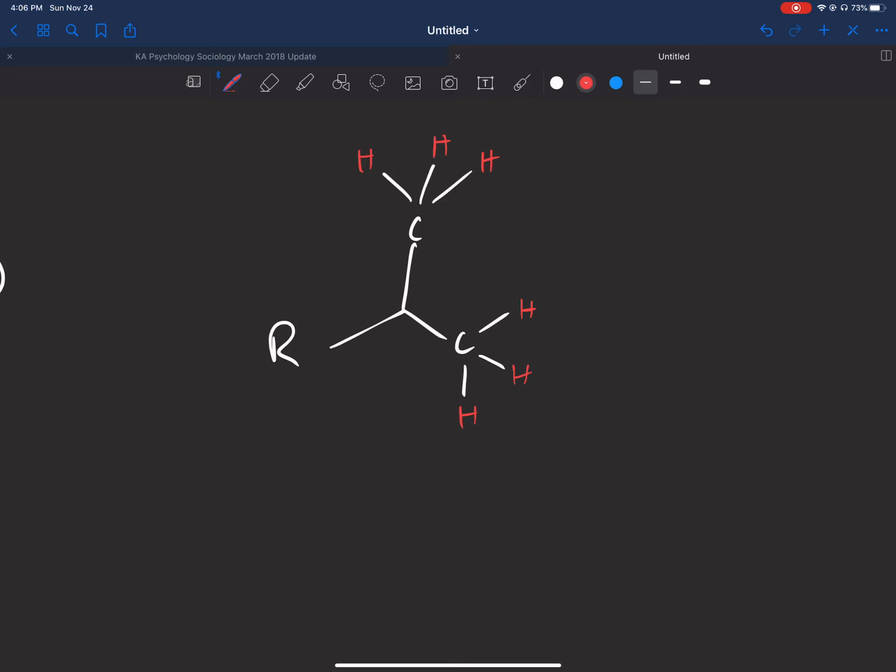Now, before we get started, this question doesn't show you it, but there is another aspect of HNMR that I did not go over called integration number.